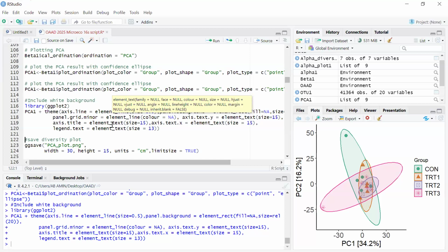But this one identifies the microbes and tries to relate them to each other, like beta diversity, to see how samples are closely related based on individual microbial taxa. Do you understand? PCA doesn't look at individual microbial taxa. It looks at the samples and whether they are close or diverse. It looks at numbers, but the beta diversity looks at closeness. That's the difference. The PCoA is particularly suited for microbiome data sets, while the PCA is not. PCA applies to lots of data sets, like metabolomics and other things.